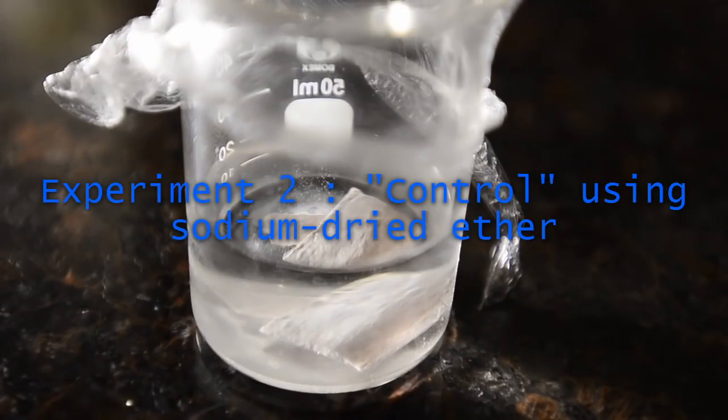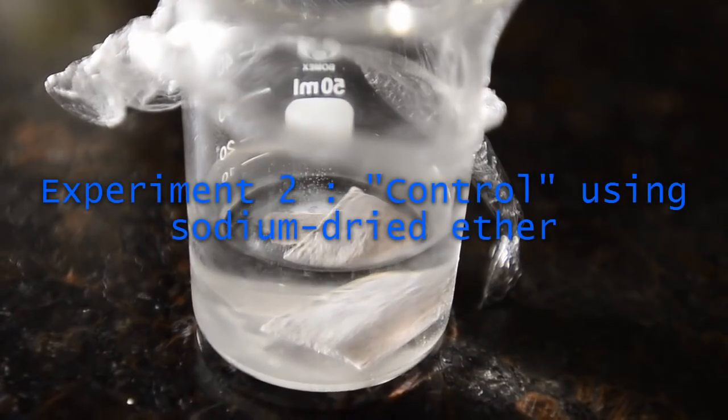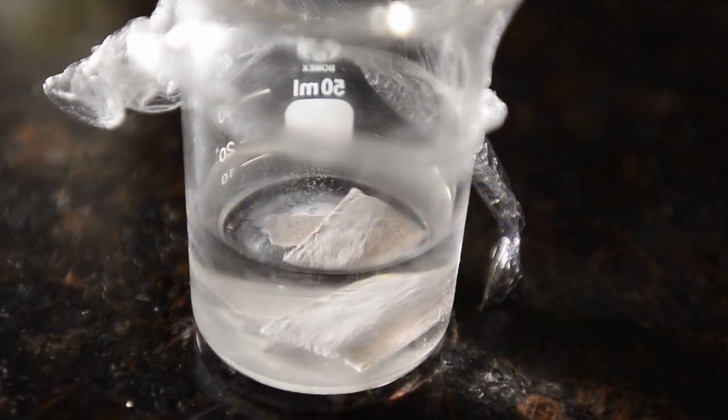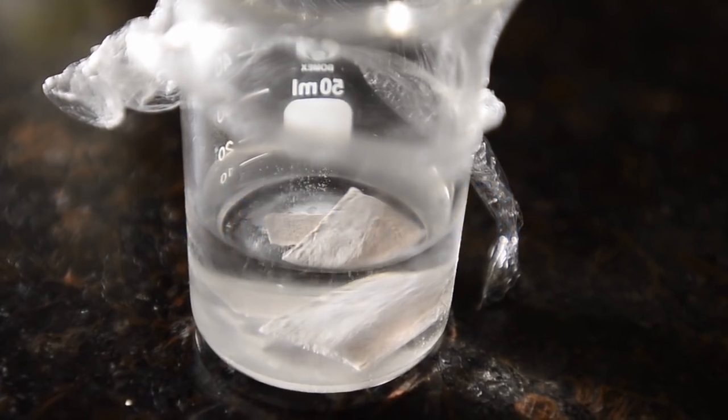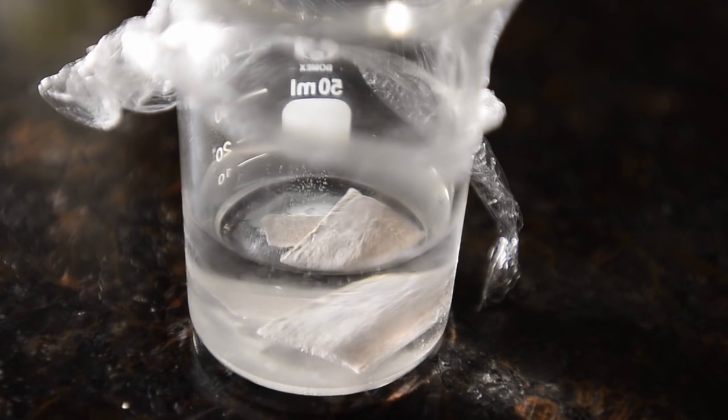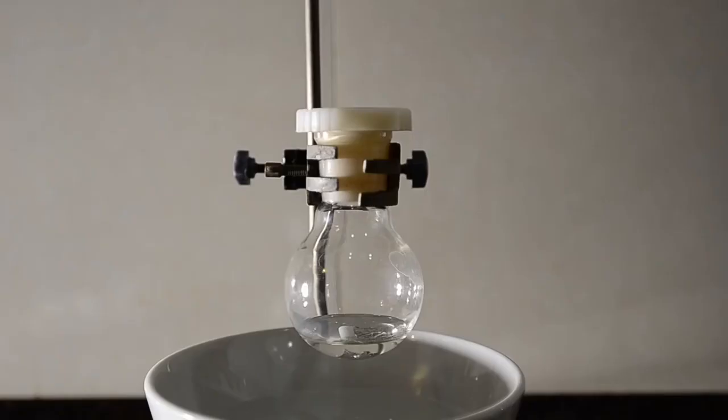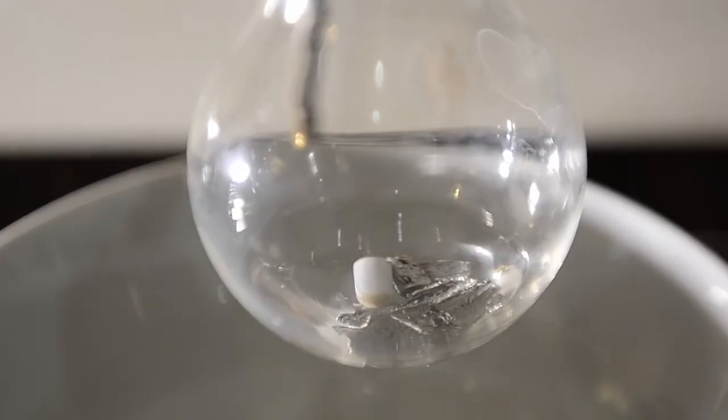Next we did a control experiment where we thoroughly dried ether using a few small slivers of sodium metal. You can see from the hydrogen bubbles that the ether does contain some water. We then did everything in exactly the same way as before.